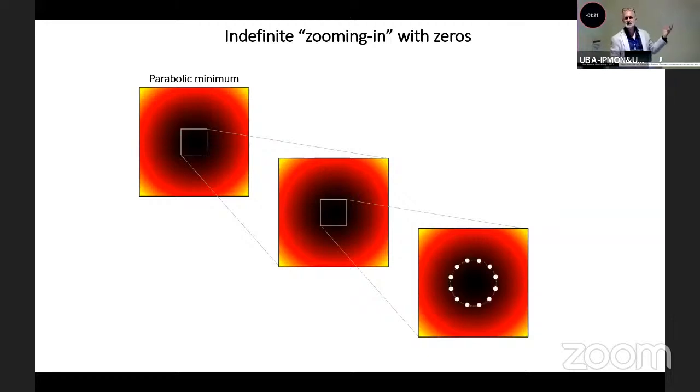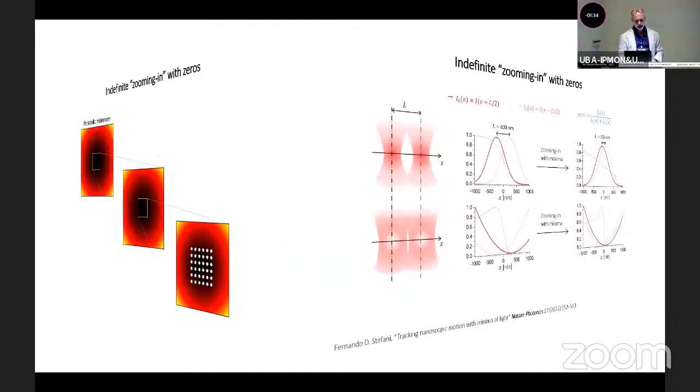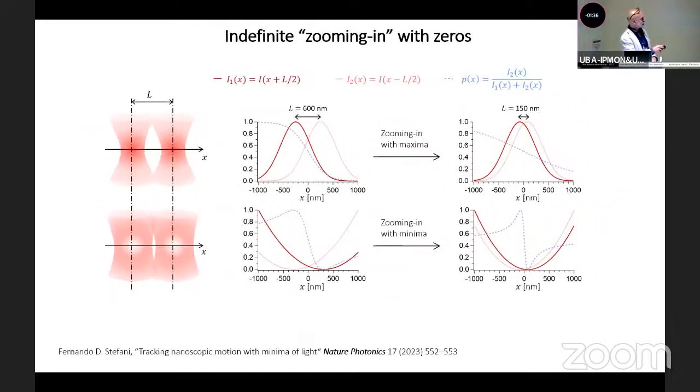And then it doesn't matter how you probe that minimum. You can probe it with an orbit, or you can probe it with a MINFLUX, or you can probe it with a raster scan. Okay? The main idea is to use a minimum. Well, in this paper, I try to explain these advantages in a didactic way in 1 dimension, to explain why you can bring closer and closer to minima, but of course this can be expanded to more dimensions.